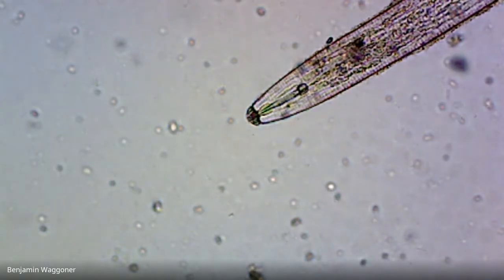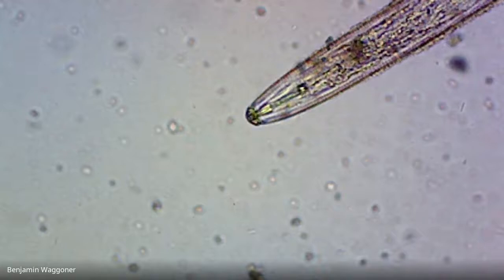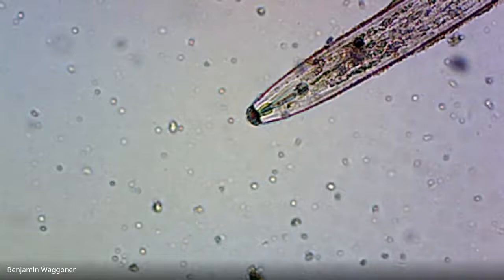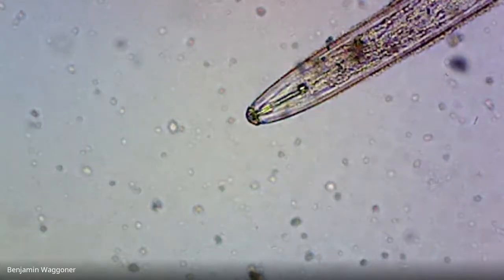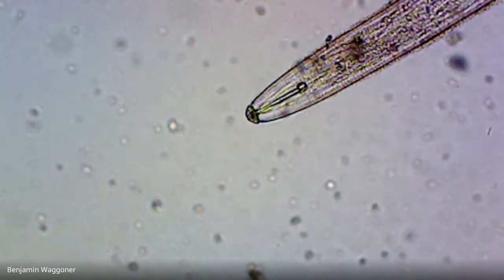Yeah, that's got some kind of lip structure to it that's not usual, and it looks like it's got little rings on the cuticle as well. So yeah, that's a species I don't think we've seen. I don't know what it would be, but yeah, that's a nifty find. That's new. Okay, those are the ones we've already seen.